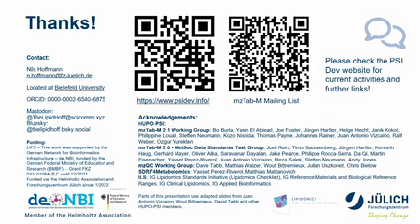Yeah, I get the problem. I think one of the main factors also with the Metabolome Hub is to also store the raw data always, so you always have the possibility to go back to the vendor format. But that of course means we need support by the vendors to get the data out in a way that doesn't lead to artifacts and doesn't increase the variability. And I think that's something that we cannot solve alone. So that's really something where we need support and also need to define testing for that.